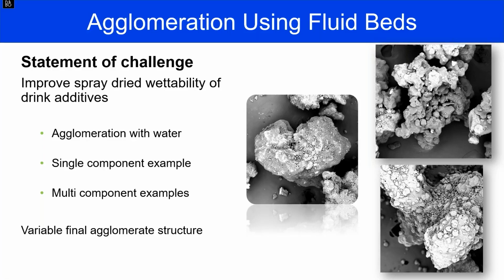It seemed to be okay. I can see that it looks like there's flowability on this, or the particles have kind of smoothed out, an indication of adding too much water too fast, or the droplet size is too big. But look at these 2 particles down here. These are blobs. It met the requirement. It was still wet enough, and I think it's because there was enough surface structure on here to give wettability, but it didn't have the wettability that it could have had, and it made a denser product because we took a lot of that porous structure out of there.